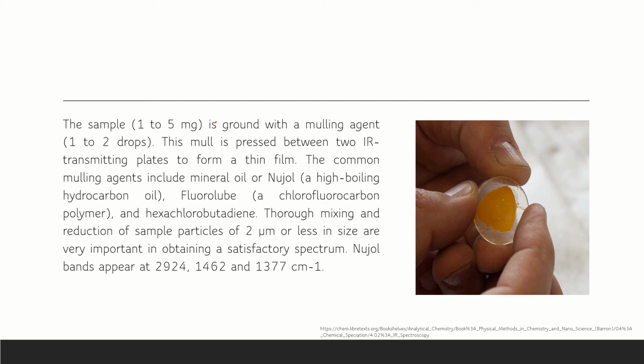Another method is to prepare a mull. In the mull method, instead of using alkali halides, KBr or NaCl, we use mineral oil or nujol, fluorolube, etc. for thorough mixing and reduction of sample particles to 2 micrometer.